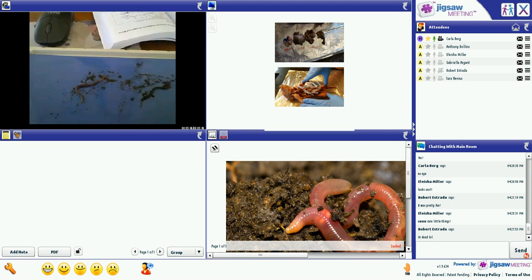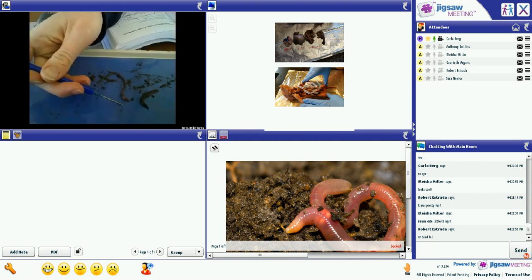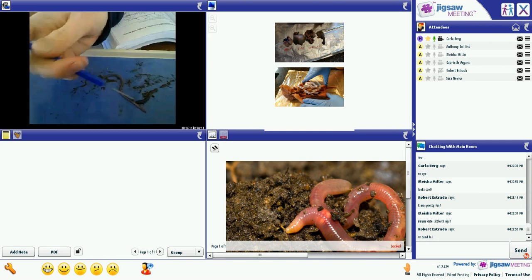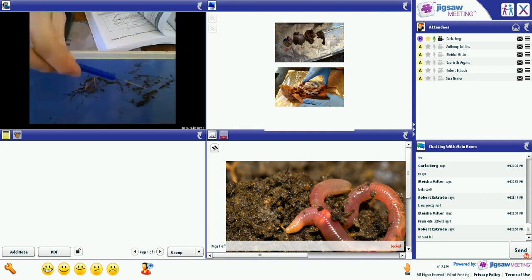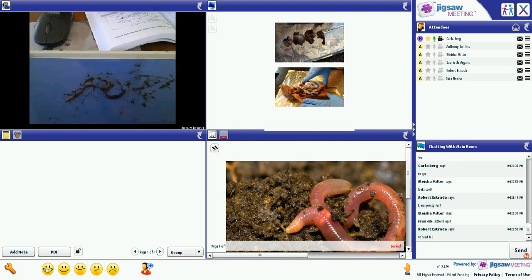Okay, so flip to page 114, and on number 1, you are going to label the parts of your worm. So the clitellum is the thicker part towards the anterior end. So go ahead and label that. And then you can label the anterior end, and you should be able to label your posterior end. These guys are terrific. They are very active, which is great.